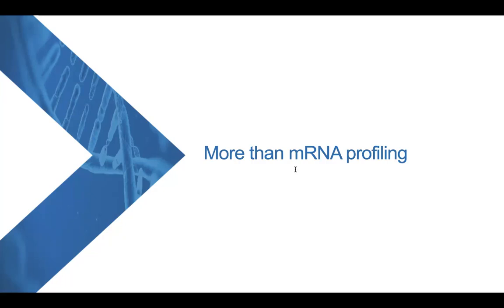Another question is, in case of automation of mRNA, how do you make sure that you are dealing with a single cell without the chip? So basically, we collect the barcoding beads which have mRNA attached to them, and we remove them from the chip. So this is how it works. And then we just convert the mRNA into the cDNA.